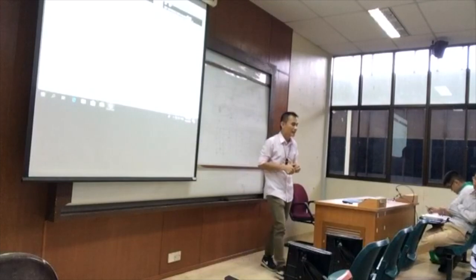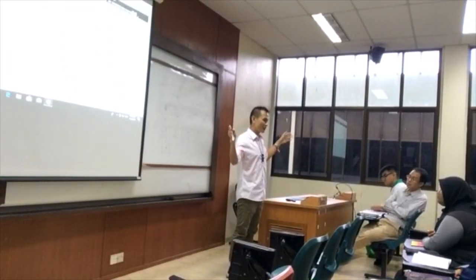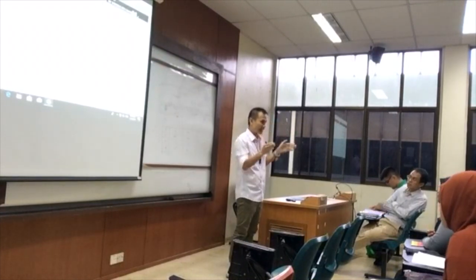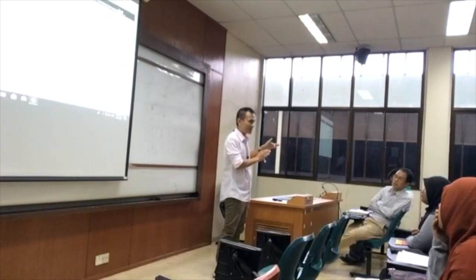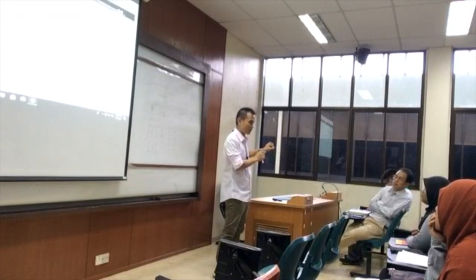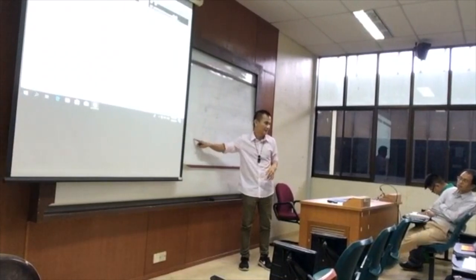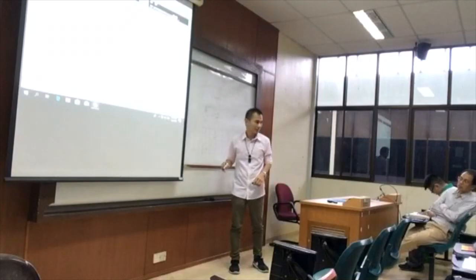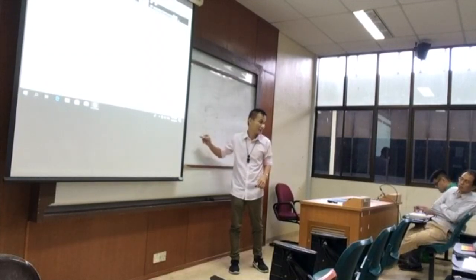Okay, but which one is the longest among all the bands? The complete genome, the complete DNA will be the longest, yeah? And then your target DNA will be the second longest, and your primer will be shorter, and your single nucleotide will be the shortest. So if they move like this, which one will move the fastest? The free nucleotide will be moving up to like that. The primer will be from there, and your target gene will be somewhere there, and your real genome will be there. So that's how you split them.